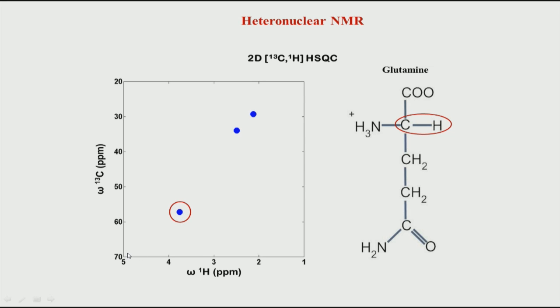If you recollect our 1D proton and carbon NMR part in this course, we saw that if there is a carbon attached to an electronegative group, or a hydrogen attached to a carbon which is attached to an electronegative group, they come downfield shifted because of the deshielding effect. Now, let us move to the second one. This is CH2 and it is now coming in the center. The reason being, this is an aliphatic spin system. So, there is shielding, like we saw with the inductive effect.